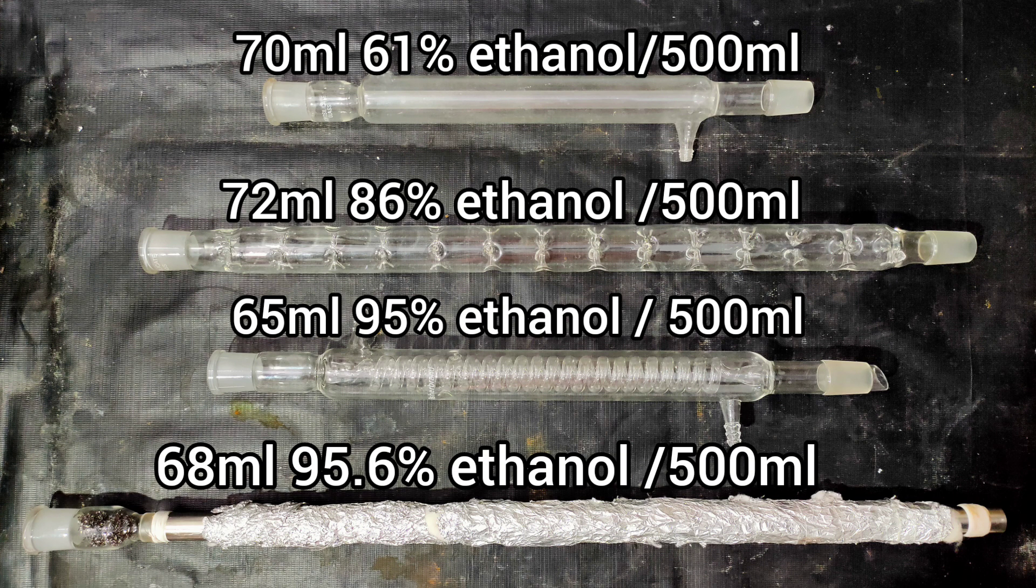But it's pretty costly but multifunctional. So here is the summary of the efficiency of the fractionating columns I tested. As you can clearly see, our DIY fractionating column is the topper of this test. The Graham's condenser also gave very tough competition to my DIY fractionating column. So which one will be your preference and why? Comment down below.